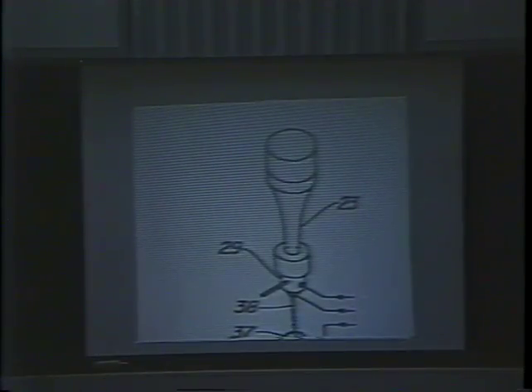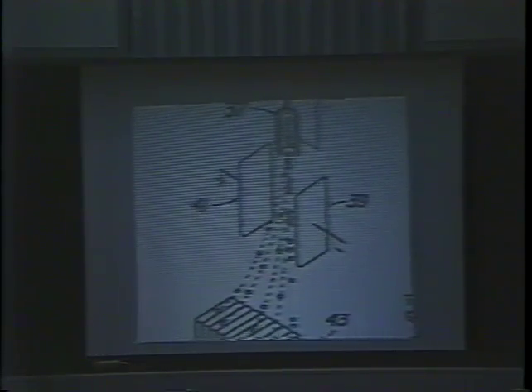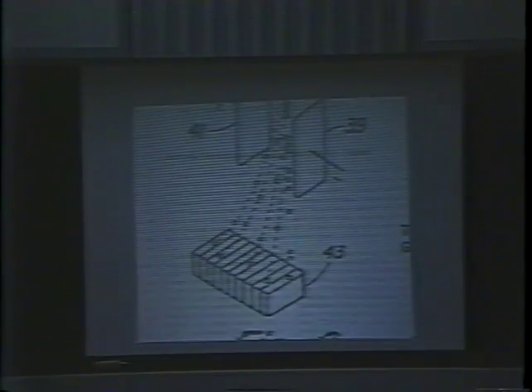In the end, Mac Fullweiler and his colleagues succeeded in building an instrument that could sort cells based on their size or volume. He described his invention in an article in Science in 1965 and received a patent for it 3 years later. The physicists, Van Dilla and Fullweiler, used the sorter for a variety of experiments they conducted themselves, but they were not successful at getting the biological group at Los Alamos excited about the new instrument, even though it allowed for quantifying and analyzing large numbers of cells quickly and accurately.